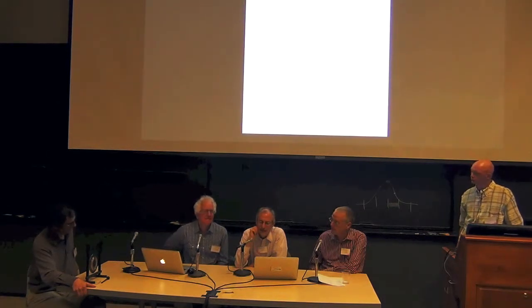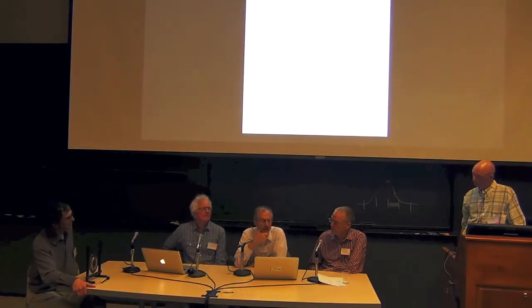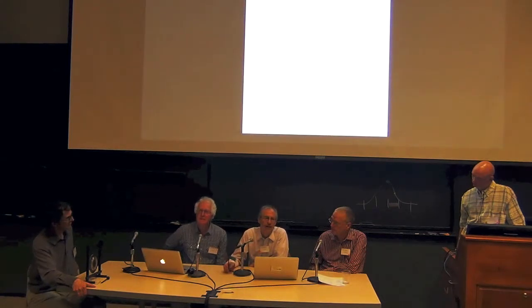Looking at the table 1, they did show that they had collected images every 1 degree, but they also had a very large unit cell, something like 200 by 200 by 200, and a wavelength that suggested that all of the reflections at higher resolution would probably overlap because of the way the data was collected.